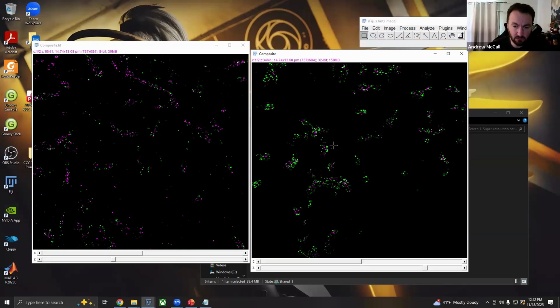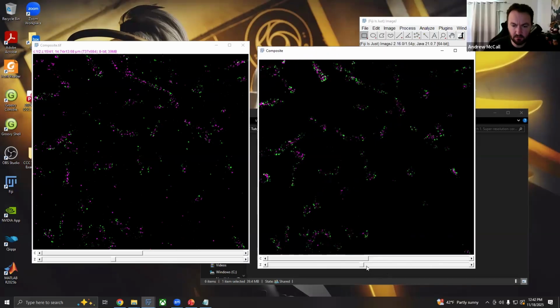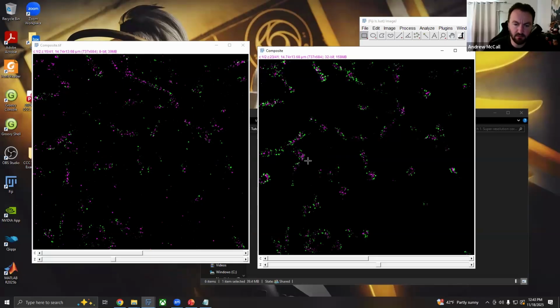So rather than even trying, I make it so that it does give you just absolutely crazy values so that people don't think that there's any correlation in terms of the intensity here to here. The relative intensities within the image do have a meaning, right? So brighter intensities within the image mean that contributed more or less. Could also mean that the intensity in the original image was brighter.